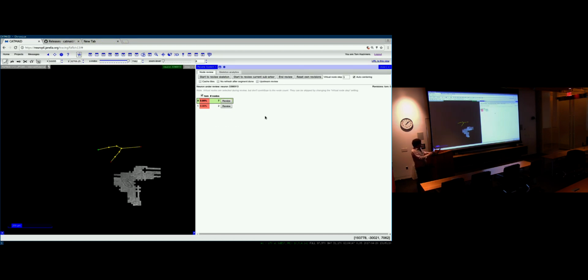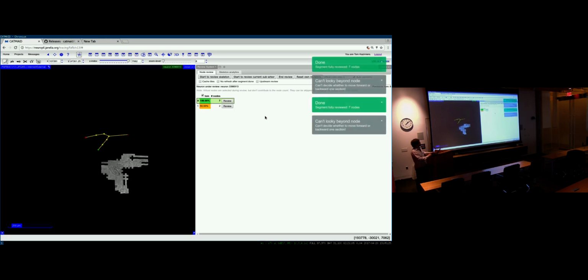It will start at the root in this particular segment, and you have to use Q to move forward, so the keys are not reversed. They stay consistent. Q moves downstream, W upstream. So with Q, you move now to the end.